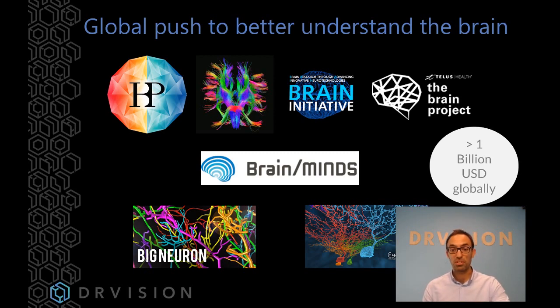The other project on the far right on the bottom, EyeWire, is now relatively well known, but if you didn't know it, you should also check it out. This is a crowdsourcing game where you manually trace neurons from serial EM datasets.